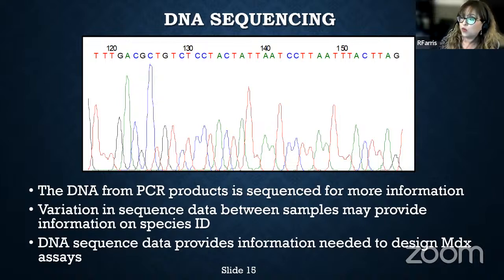And so a lot of what we do is analyze forward and reverse sequencing. If you go back to Biology 101, remember, DNA is what? Single-stranded or double-stranded? It's double-stranded. Because it's double-stranded, we can go that extra mile and sequence both the forward sequence and the reverse sequence, which is what we call them. One is the forward, one is the reverse, and we can sequence both of them. They're going two different directions, and then we can align them.